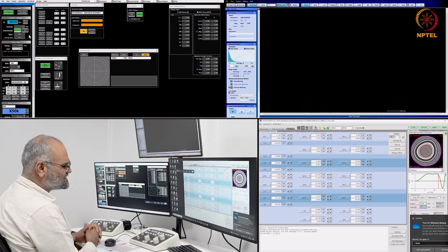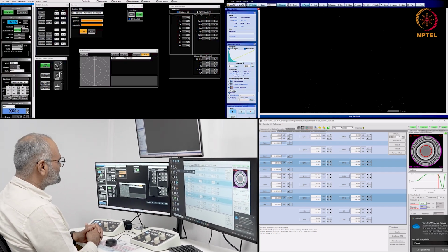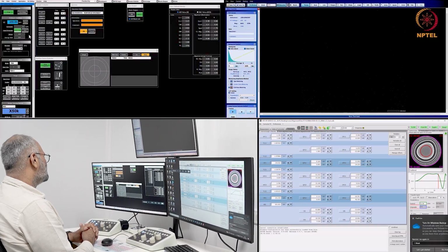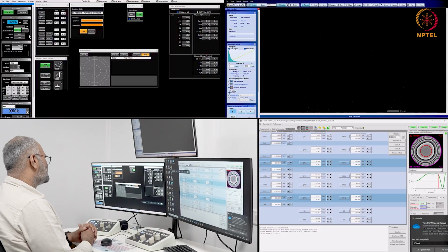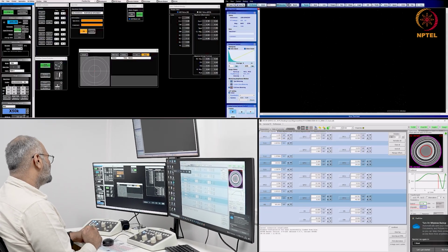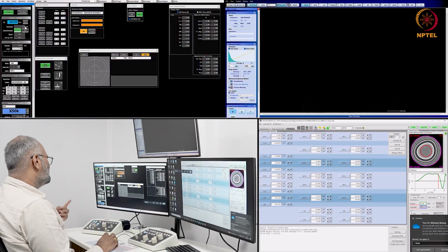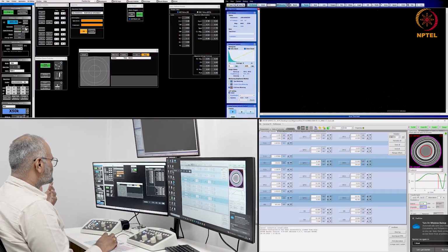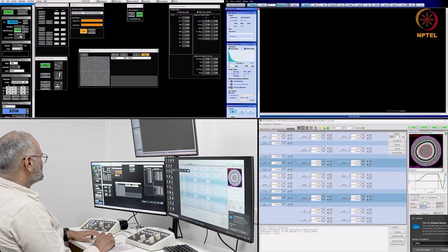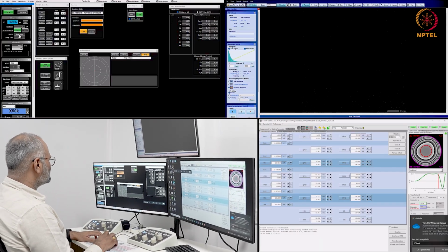I wouldn't really call it a drawback, but in comparison with the Schottky FEG and the thermal FEG, the emission currents are not sustained at a steady value over a very long period of time. But nonetheless, if your emission currents are good enough to get some good imaging, that is already good enough, and the coherence is really good. So now the status is operational.